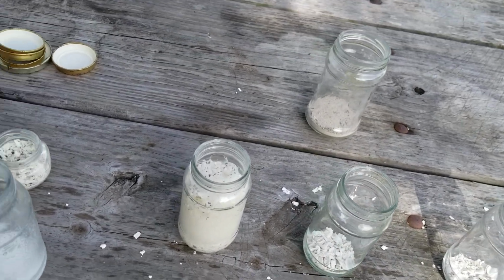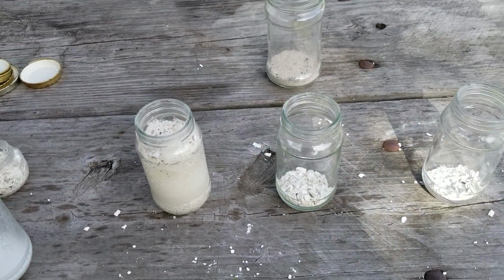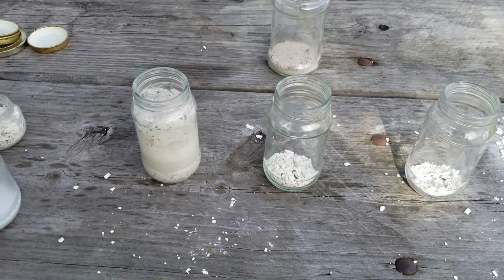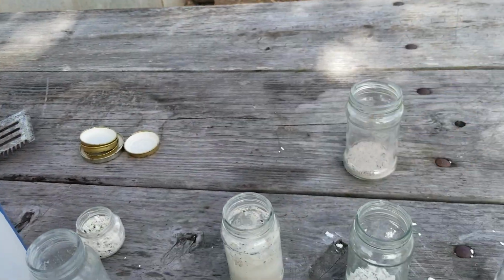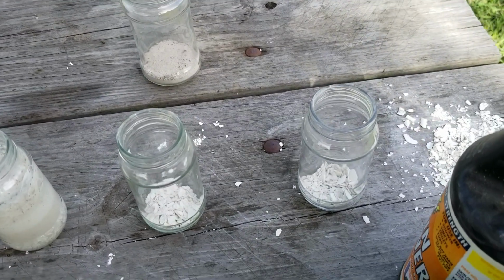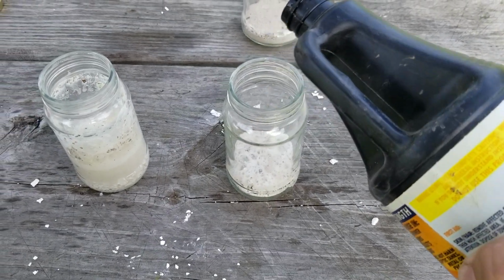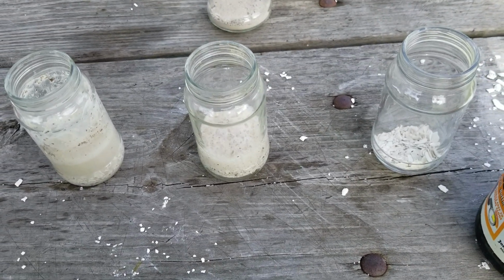And the reason why is that vinegar is a weak acid. It is acetic acid, but because it is a weak acid, it does not want to entirely dissociate in solution. So the reaction actually occurs rather slowly. Another acid we can try is sulfuric acid. Now, sulfuric acid forms calcium sulfate, which isn't entirely soluble. So the reaction to this is probably also going to be a little bit on the slow side. However, since this is a strong acid, it is reacting rather quickly.